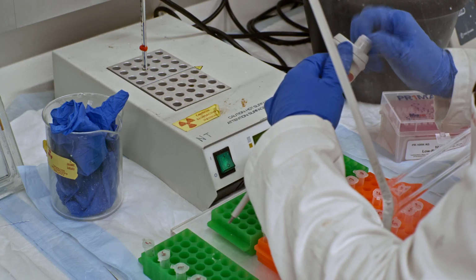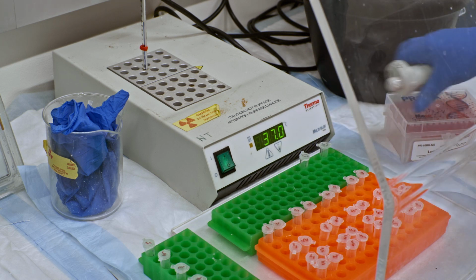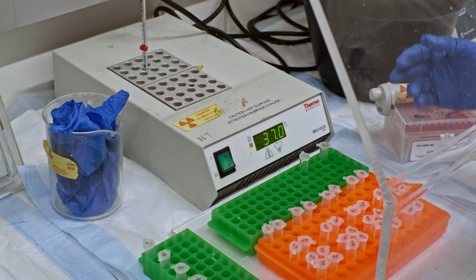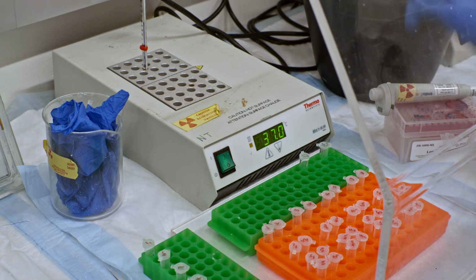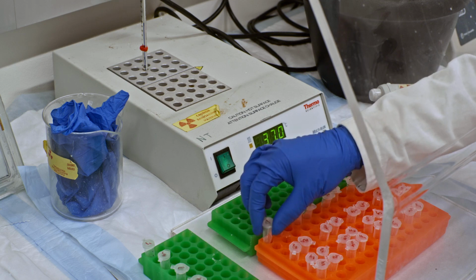So for the next part, we're going to add 50 micromolar solution of dNTPs into these reaction vessels. And so this is where the actual experiment is going to start. What I like to do here is just have my set of dNTPs here on ice, in this ice bucket. And I will retrieve the dNTPs every time I need to add dNTPs into the reaction vessel.